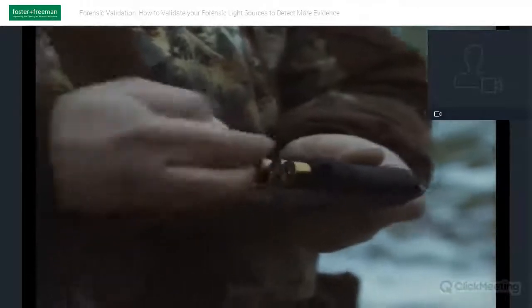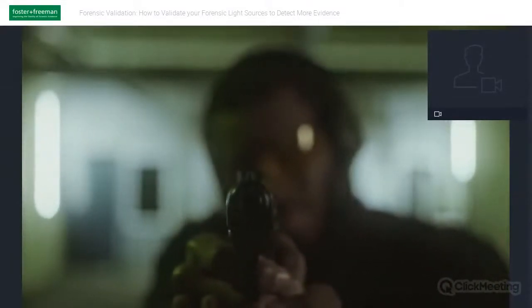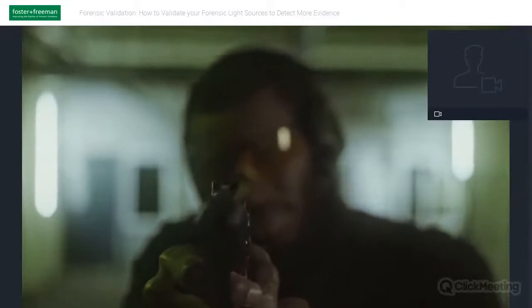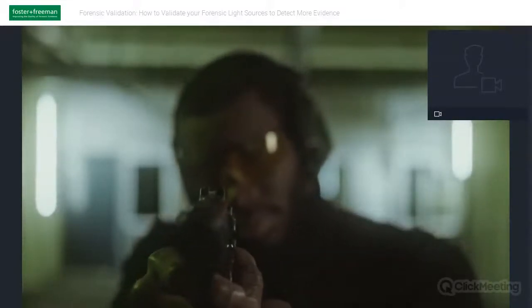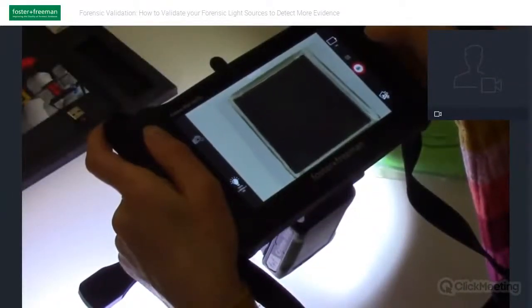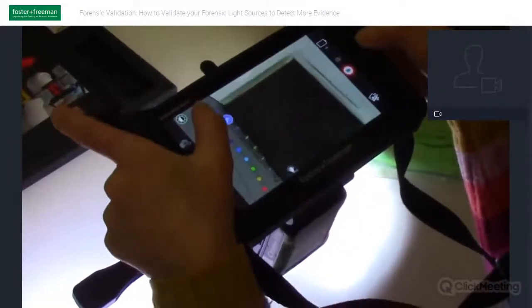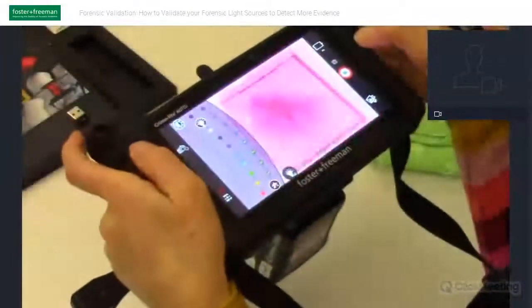Our next sample is of gunshot residues, as detailed in the paper by James Bailey et al., a non-destructive test for gunshot residues on dark and multicoloured fabrics. When a firearm is discharged, a plume of gunshot residues exits the barrel and creates a visible powder pattern, providing a specific muzzle to target distance. See our example here of a dark fabric, first in white light and then in infrared, of our simulated gunshot residue.